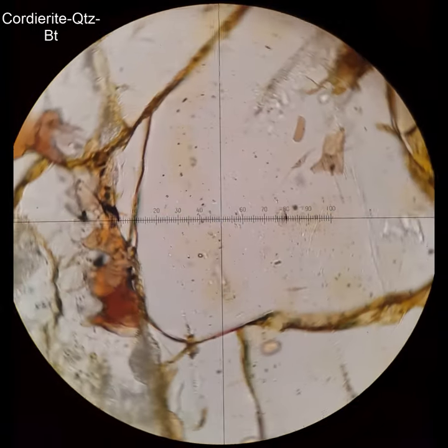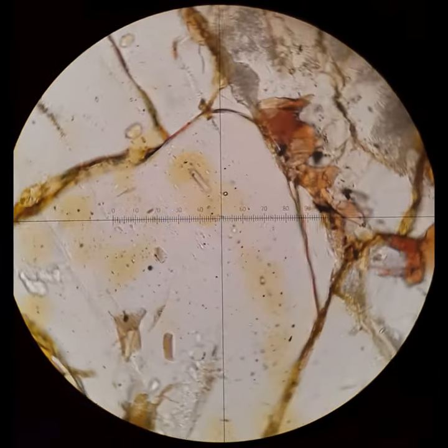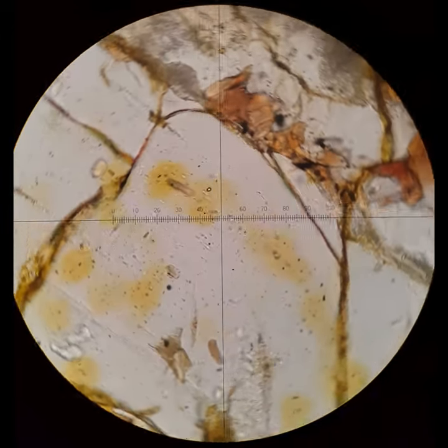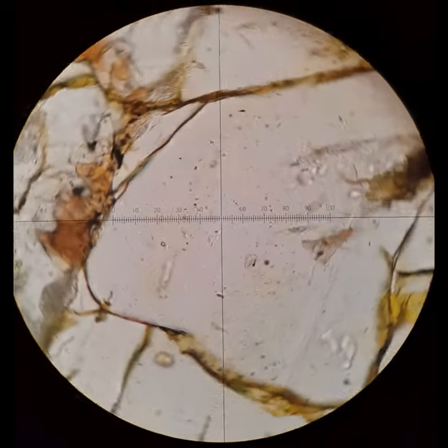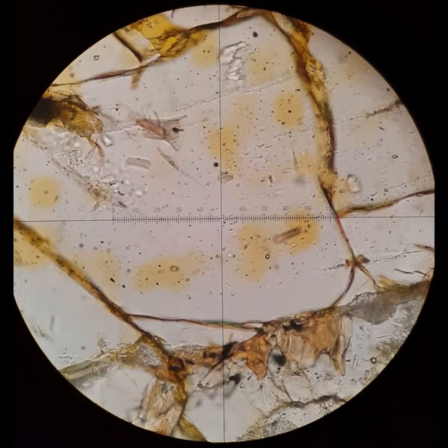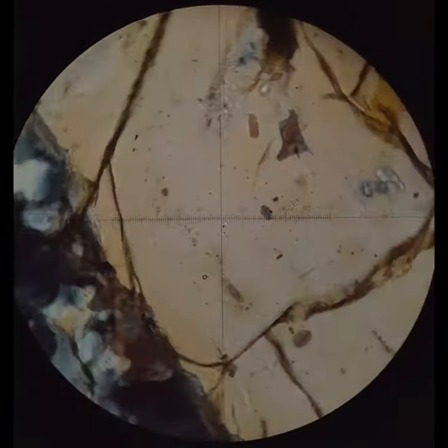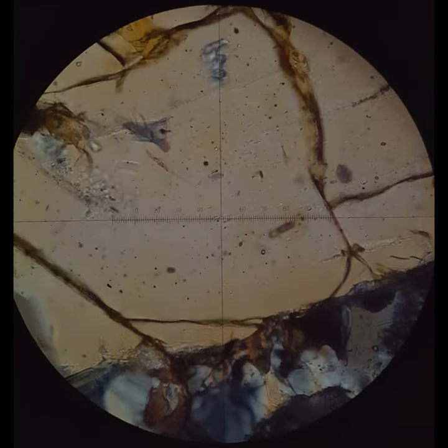And here again, the really strong pleochroic halos — dark yellow-orange. These are about the strongest I've ever seen. These are the ones that are in the middle.